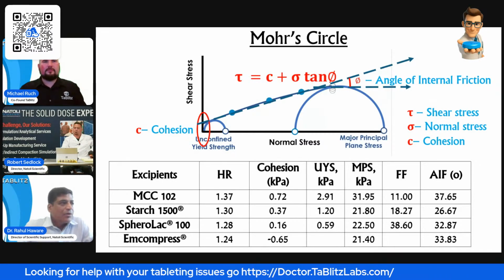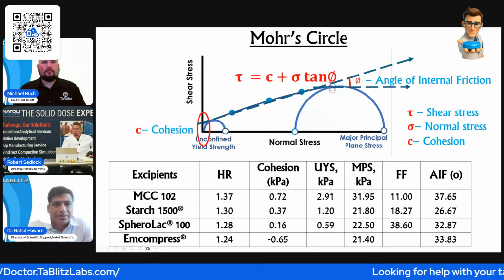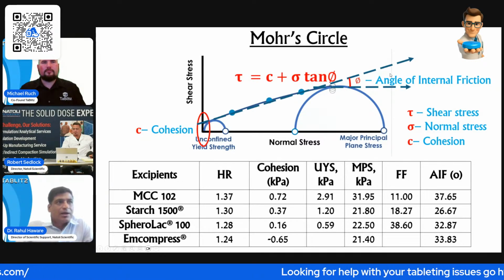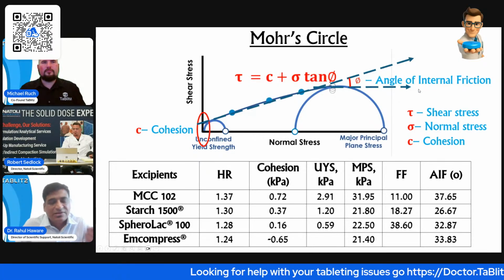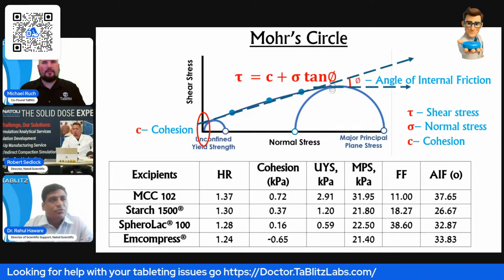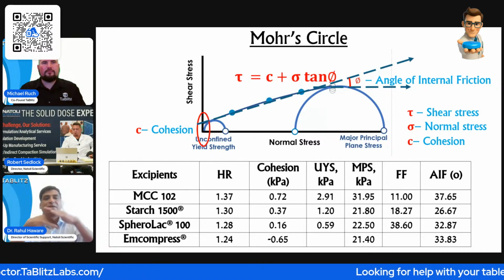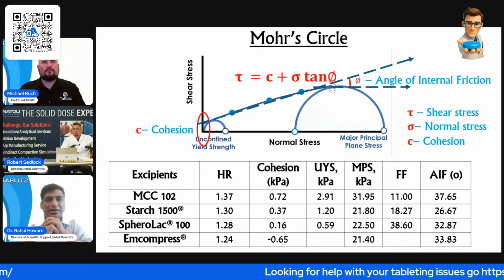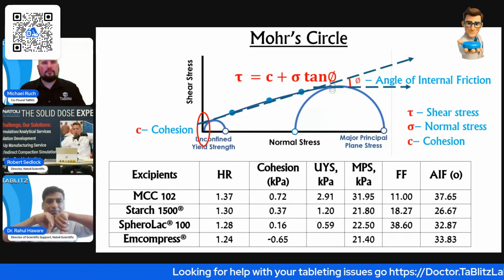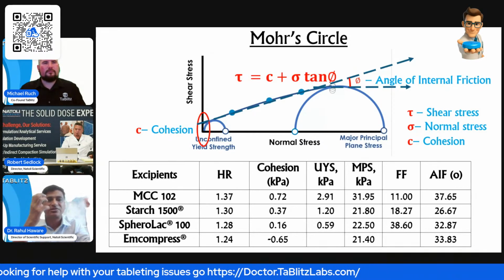The way I have done it is I have used those equations to integrate all these factors. If I understand correctly, the first part is how it impacts powder flow. When a powder has irregularly shaped particles, they will have higher friction. Spherical particles have less contact area with each other, so they have less friction and flow nicely.